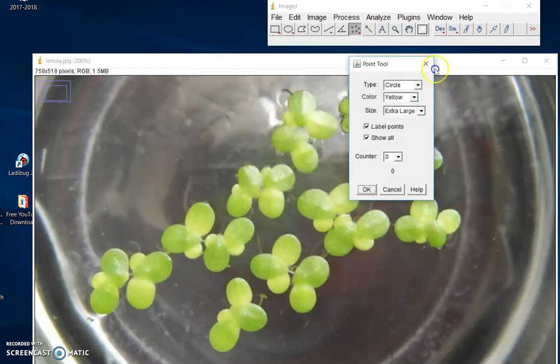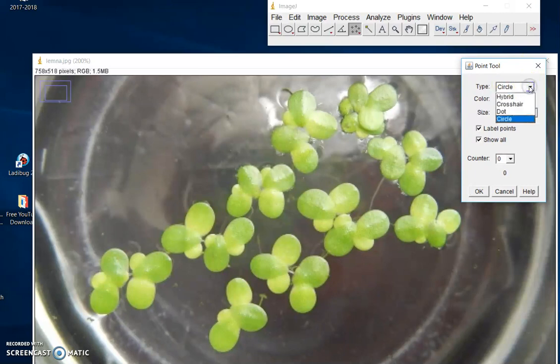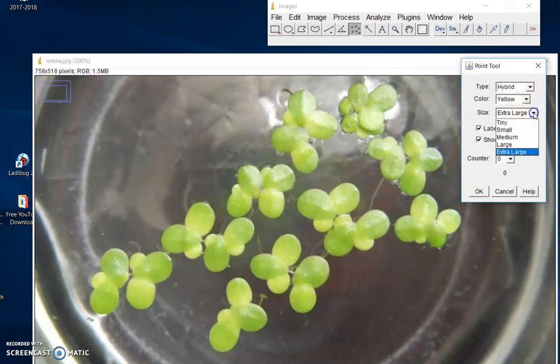You need to have this dialog box open. This will tell you how you want to mark each frog. Let's go with Hybrid, let's go with Yellow, and let's go with Large. Now it'll start counting — right now we're at zero.